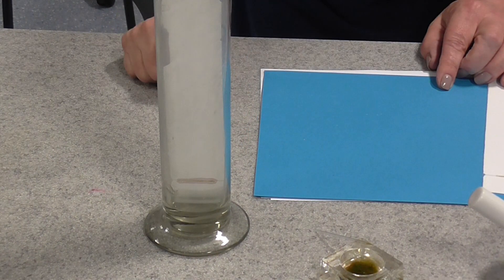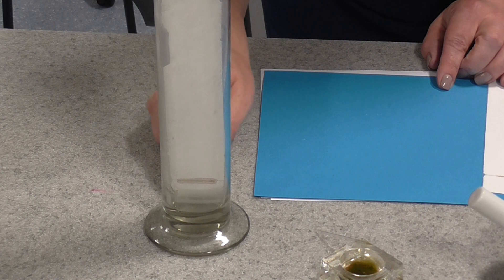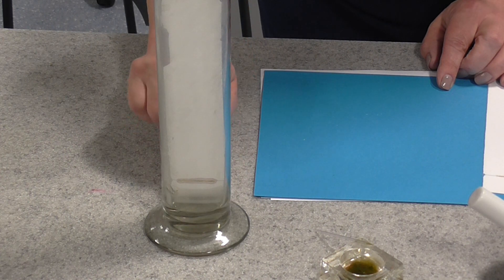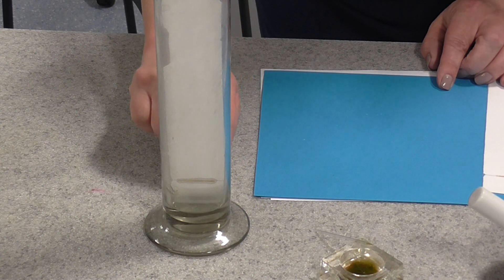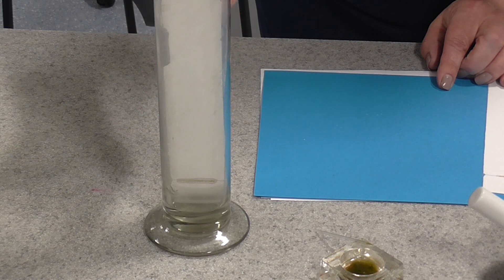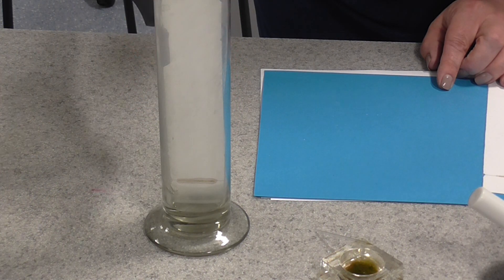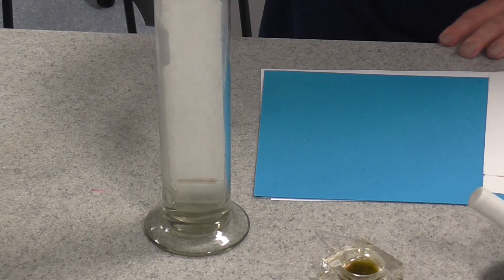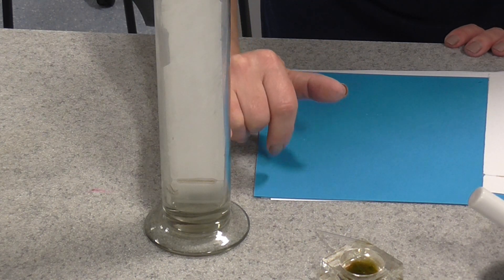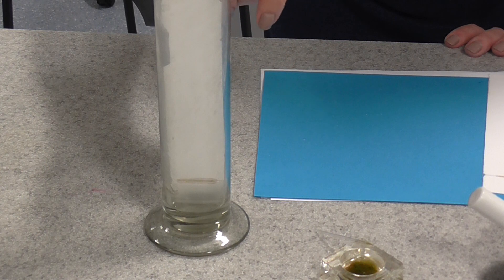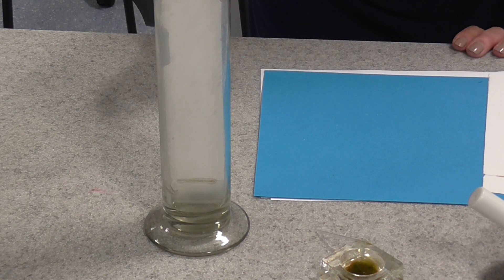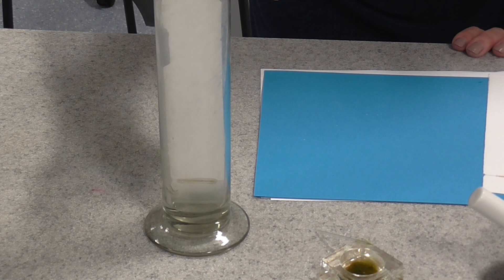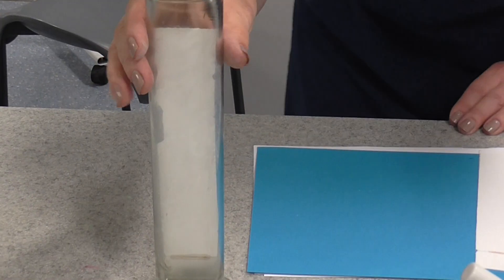Remember the TLC plate is what we call the stationary phase here. The mobile phase is our solvent which is going to dissolve the pigments in the plant extract and carry them up the stationary phase, carry them up the TLC plate. You're going to leave that now and watch it carefully until you see that the solvent has traveled all the way up to about maybe a centimeter or two from the top of the TLC strip.